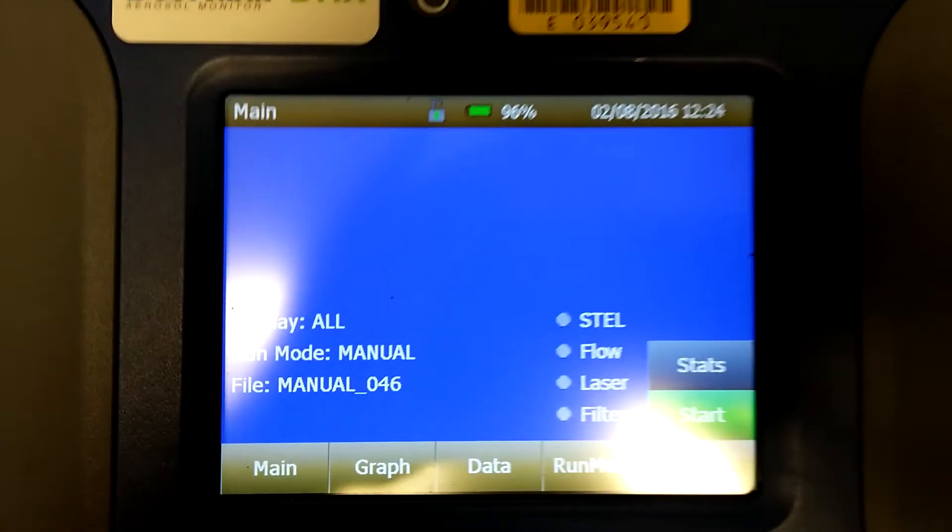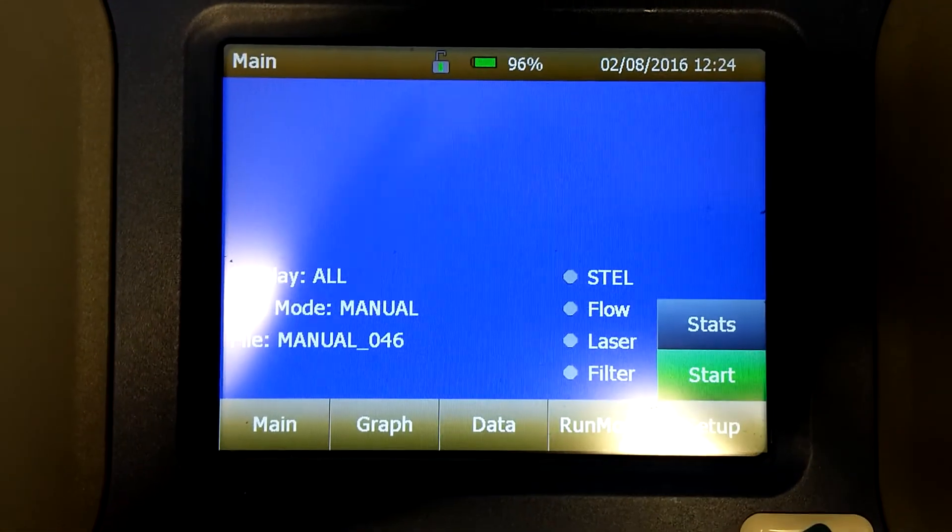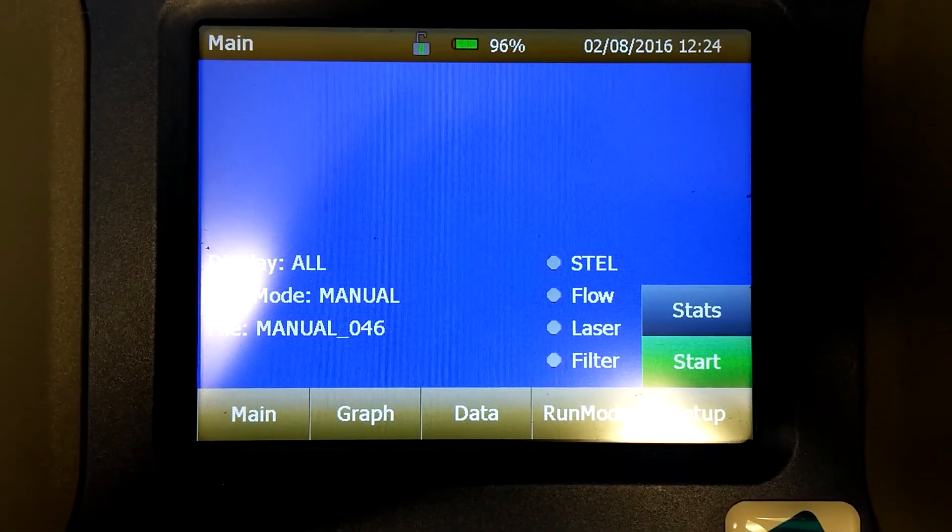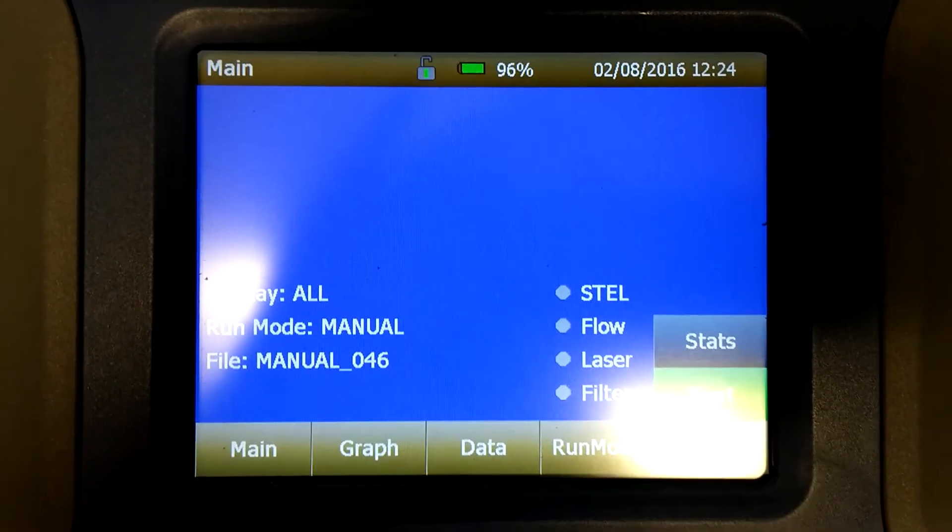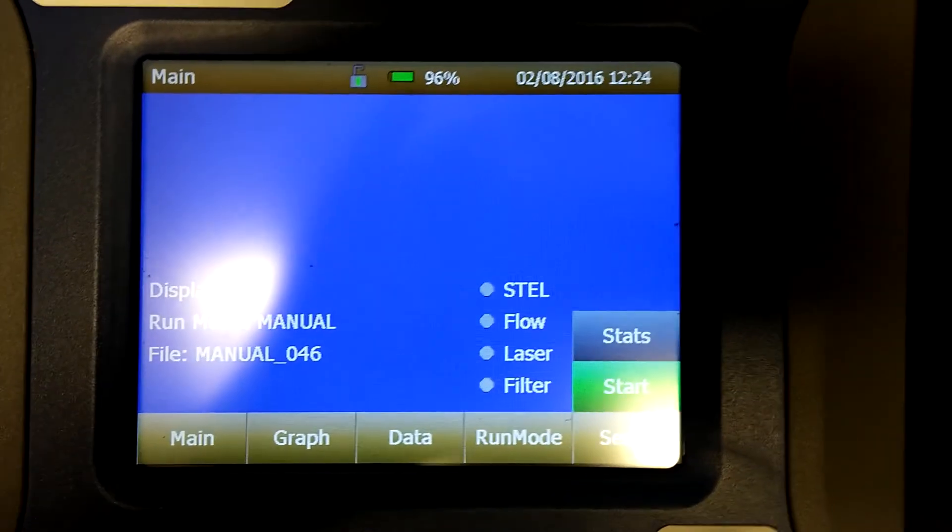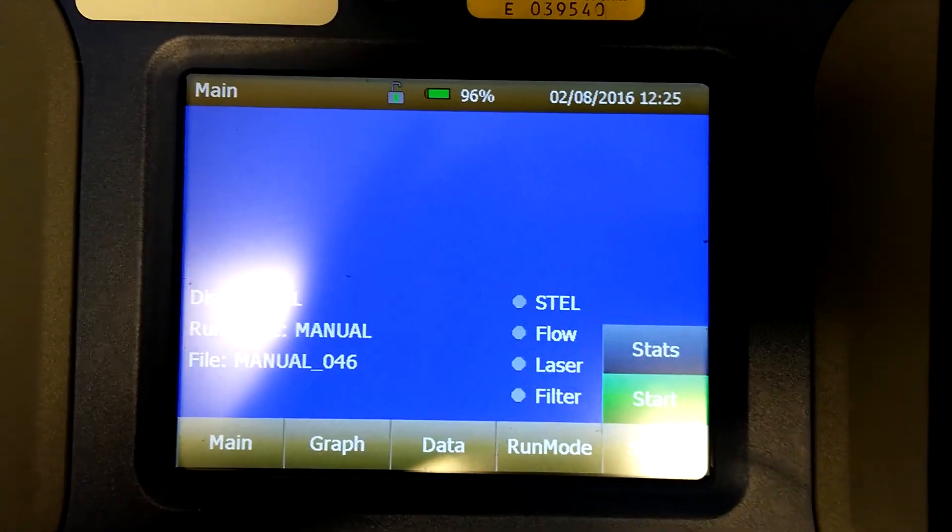And that is how you set up the run mode, the log interval, and the time constant.